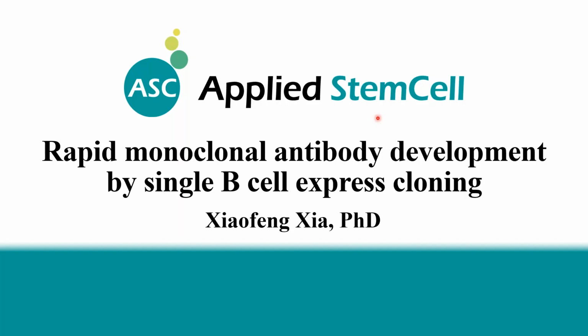Today, I would like to take this opportunity to introduce you to a new method for monoclonal antibody generation by single B-cell express cloning. I especially want to share with you our experience of using transgenic animals and special animal strains. I will show you that when the special animals are used together with the single B-cell cloning method, we are able to develop antibodies more rapidly, more conveniently, and we were able to generate antibodies with higher quality.